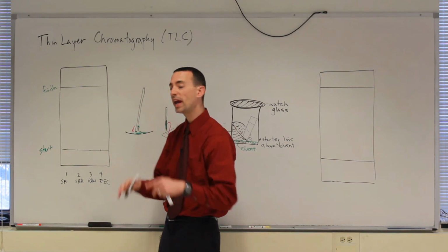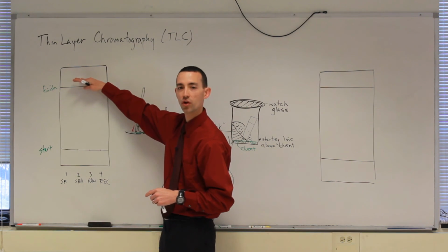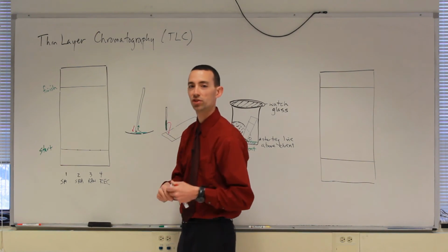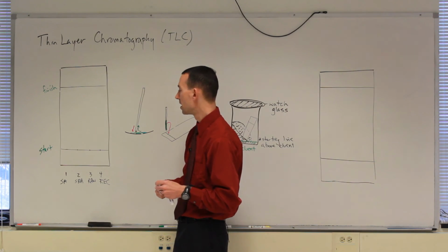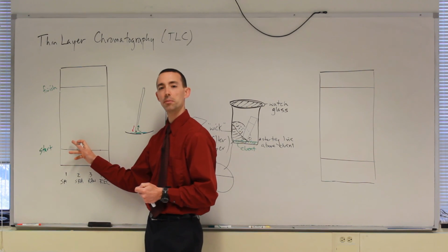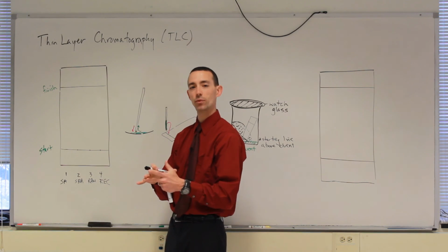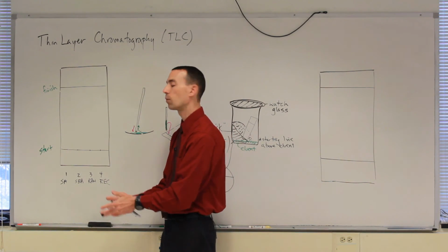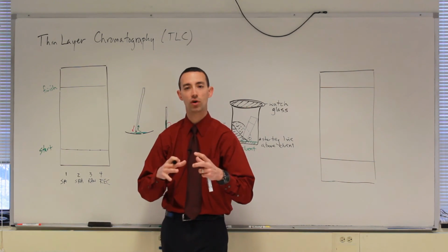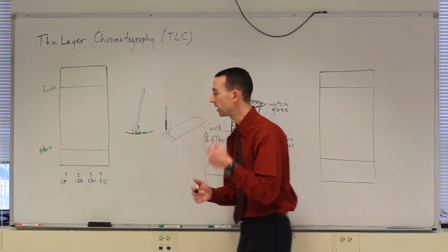So our, quote, wave is our solvent that will soak upwards along the plate. It will be drawn up the plate by its attraction to the chemicals on the plate. So a chemical has a choice then to make. Do I like the material on the plate and I want to stay where I'm at, or do I like the liquid that's moving up the plate and I want to move with it? All right, just like staying in place on the beach, or allowing yourself to be pushed inland with the ocean, okay, with the wave.